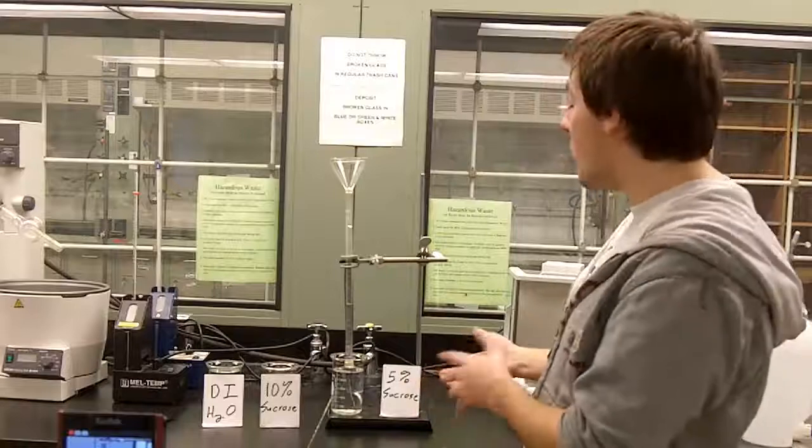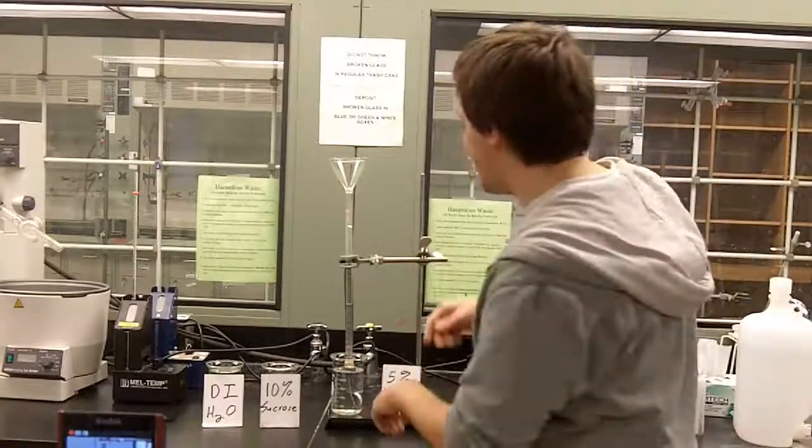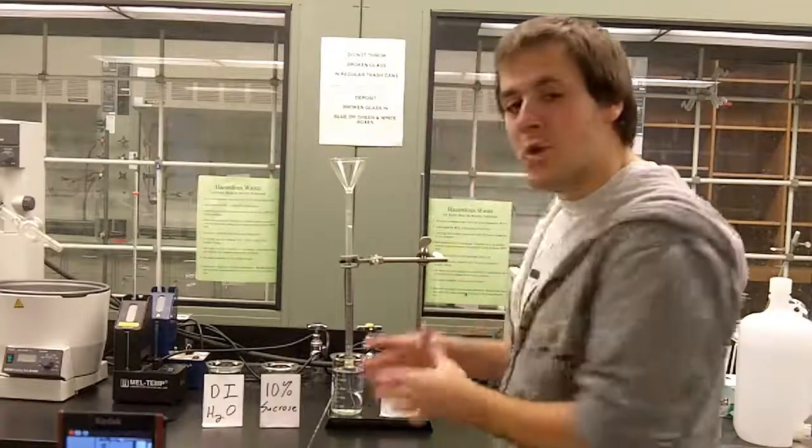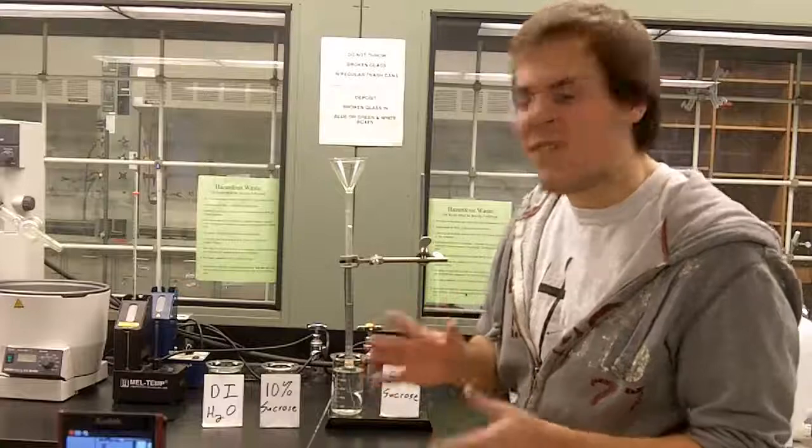Hi guys, my name is Jonathan Webster and I'm a student at Northern Kentucky University. Today we're going to do an experiment on the movement of water across a membrane — that's called osmosis. Basically, water moves from a low concentration gradient to a high concentration gradient to try to even it out.